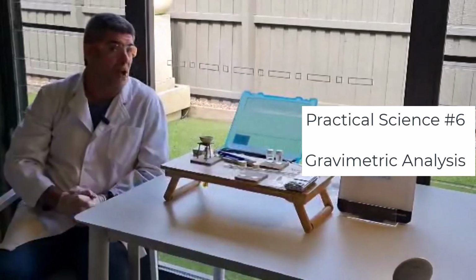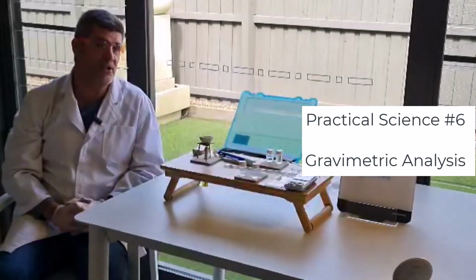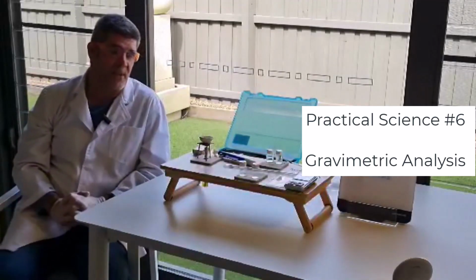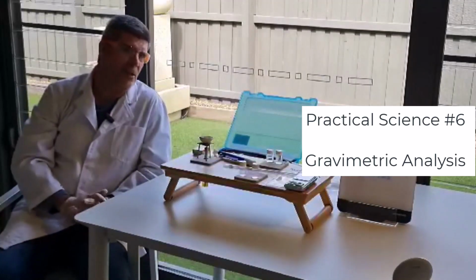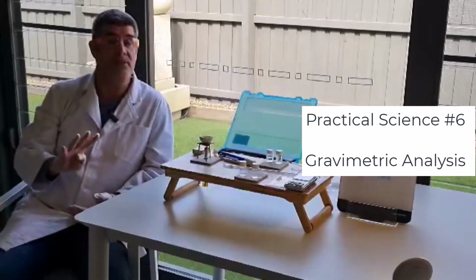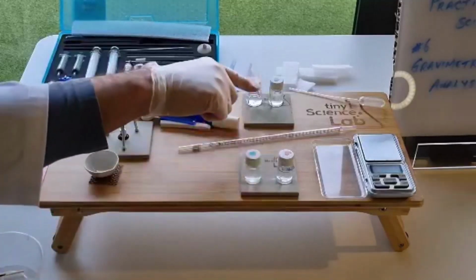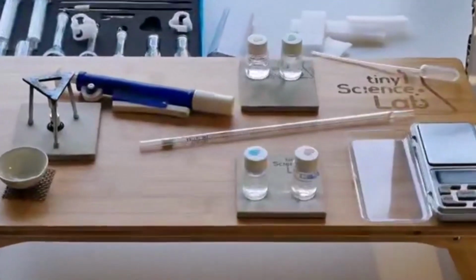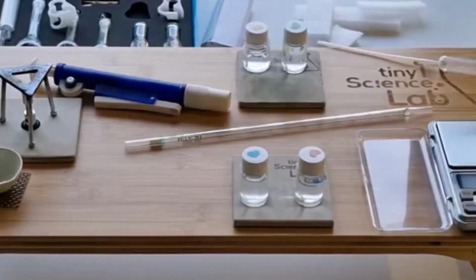At St Philip's Christian College in Port Stephens, we have 4 houses that are based on 4 of the local beaches: Kingsley, Birubi, Fingal and Zenith. Each of these is a different colour, and we're going to ask the question today, is the salt concentration the same at each of these 4 beaches? So a few months ago we collected some samples from each of these 4 beaches, and you can see the colours correspond to each of the beaches. The green is Zenith, the yellow is Birubi, the red is Fingal, and the blue is Kingsley.